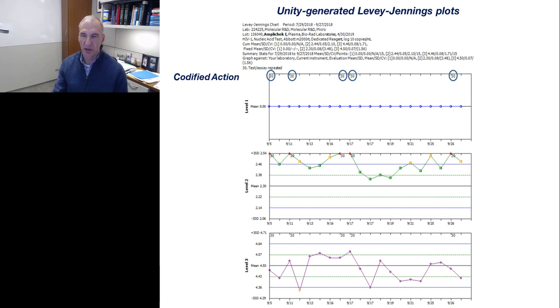So you can see an initial review of those charts, or the summary review of those charts, what was the intervention that occurred. This also shows you an example of how this particular data, the level 2, performed relative to the mean. So for this control, the expected values were 0.2 or 2.3 logs, and it was generally performing higher overall than the mean provided by the package insert.